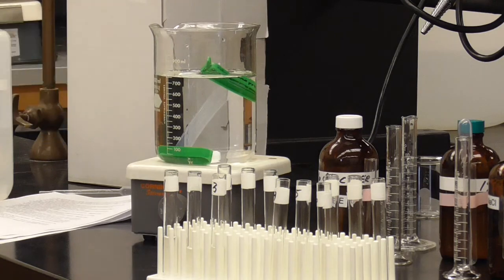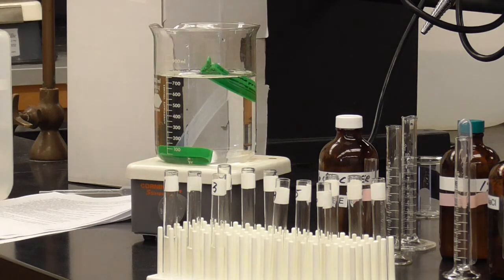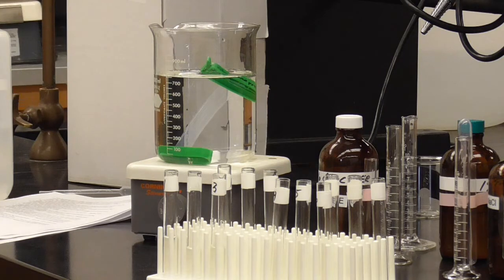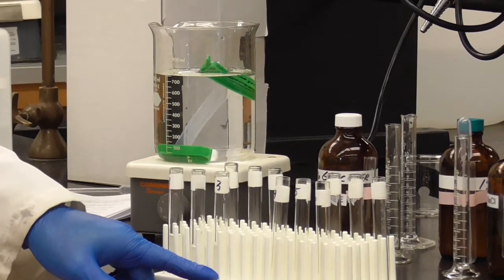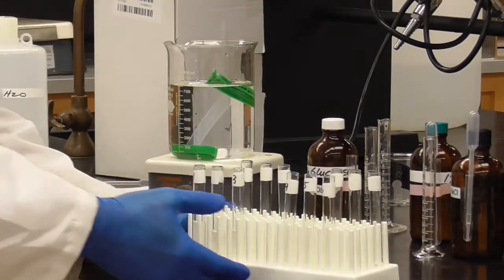Again, our solution is inside the bag. We have DI water on the outside of the bag. We took our initial sample out. Right? Now we're going to wait 15 minutes to see if those will start to cross that dialysis bag. While we're waiting, we can go ahead and do our 3 tests for chloride, for glucose, and for starch on our first 3 test tubes. So let's go do that in this first 15 minutes.